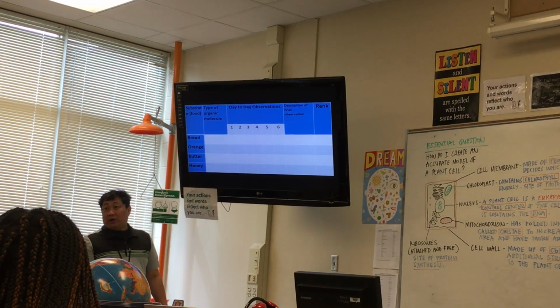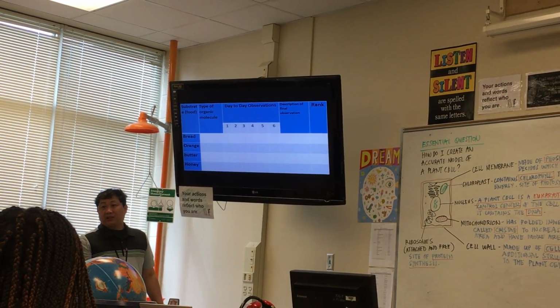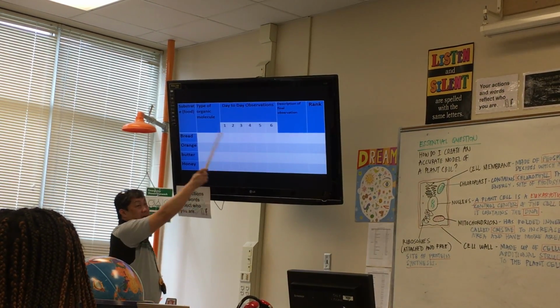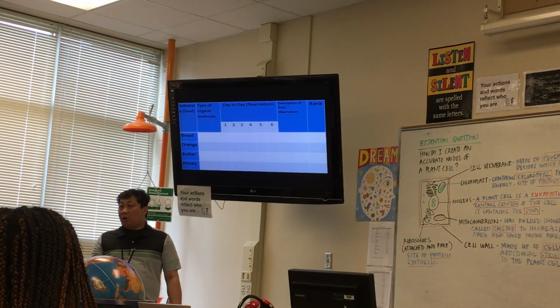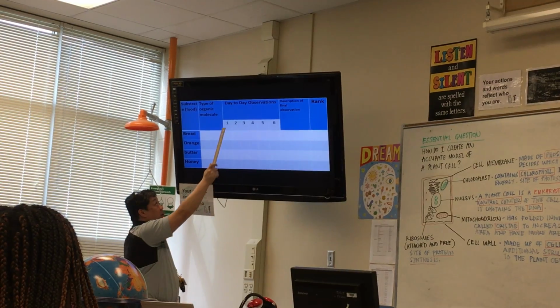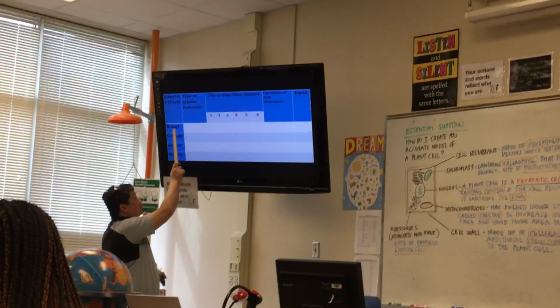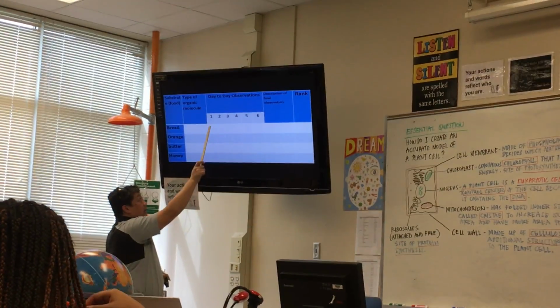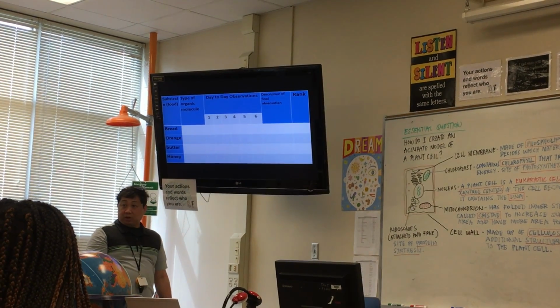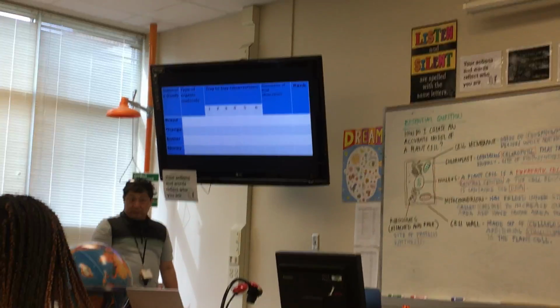Now, when you observe the specimen, if you see molds, you put a check mark. If you don't see mold on day 1, you put an X mark. Say you did not see any mold on the 4 substrates on the first day, then you have to write down X, X, X, X. So 4 X's. Do you get that?